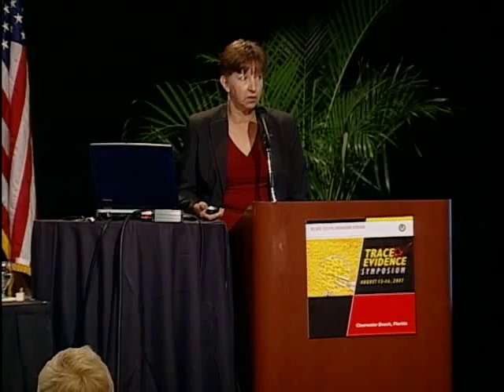I was given the window, the entire window, to examine. When the pieces of the window went back together, they showed that the source of the breakage to the window was a screwdriver on the outside edge of the window. You could see the screwdriver tool mark where the point of origin of the break was. You could see that the breakage was from the outside based on the conchoidal lines on the edges of the glass. When I examined his jacket, I was able to find glass particles that corresponded to the window.